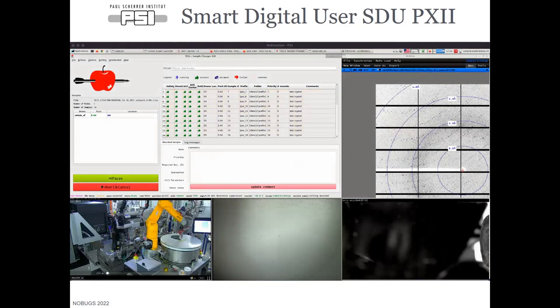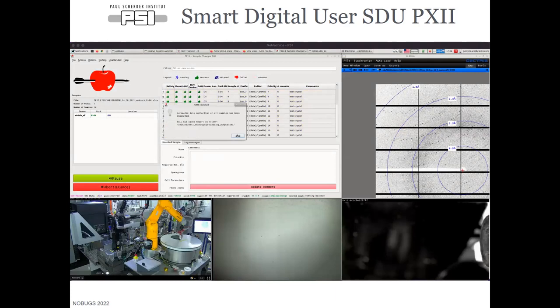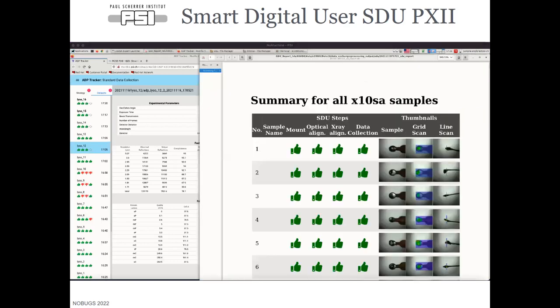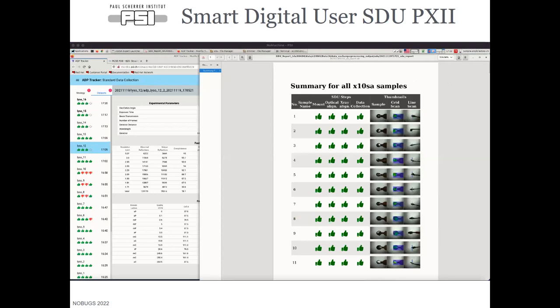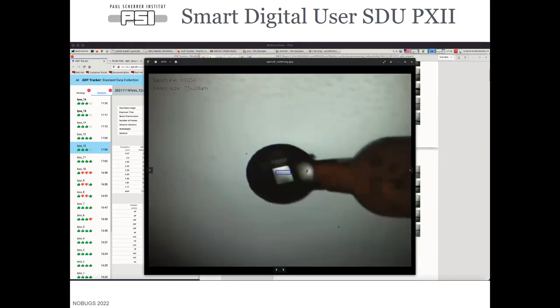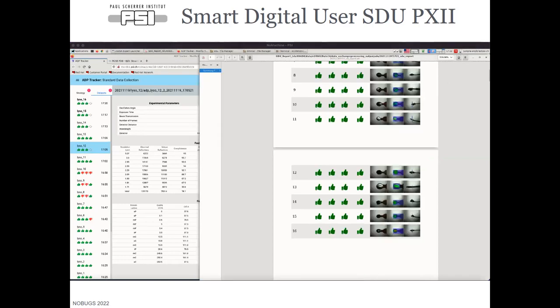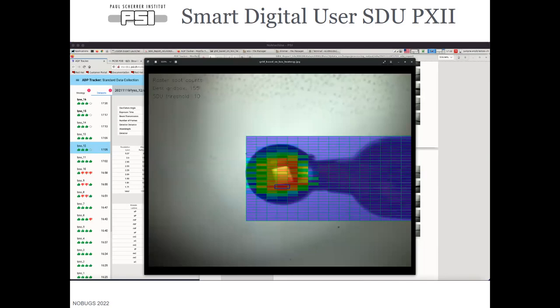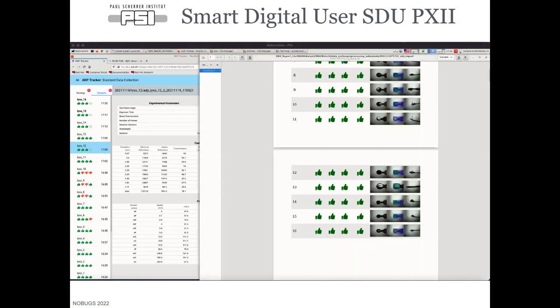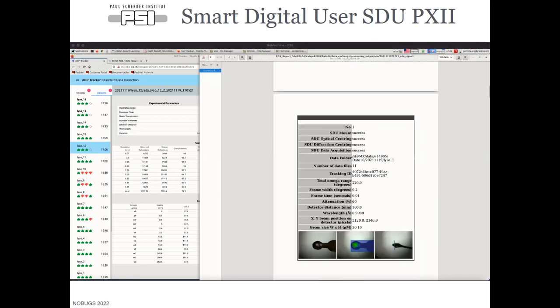We get a pop-up telling us the directory path to go to. When we open the PDF, we'll have a summary view similar to what we have in the TEL GUI, but we also have information on the grid scans — what the values were, what position was selected. We also get watermarks with the beamline and beam size used for measurements, as well as what the best grid box position was and what the spot finding value was for that. It's a nice overview to come in to in the morning and see whether anything needs to be remeasured, with more detailed information for each sample on an A4 page.